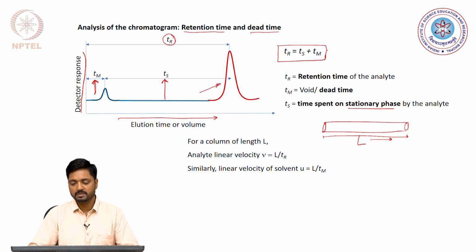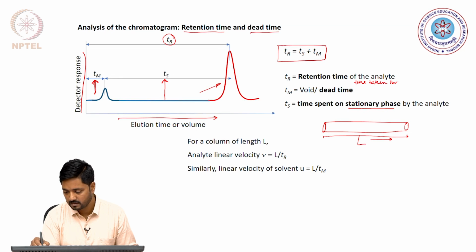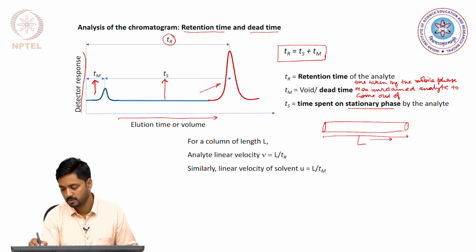Now, we already described the dead time or the void time by explaining that it is the time taken by the mobile phase or an unretained analyte to come out of the column of length L.